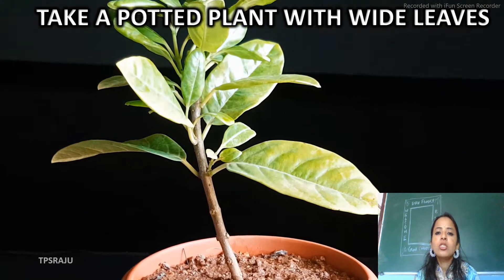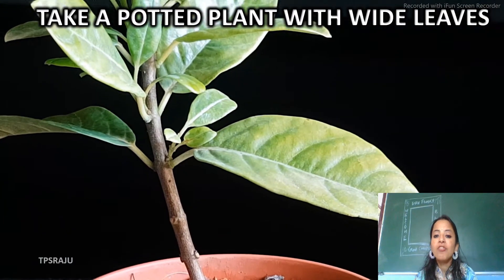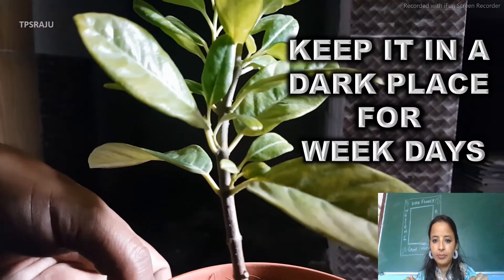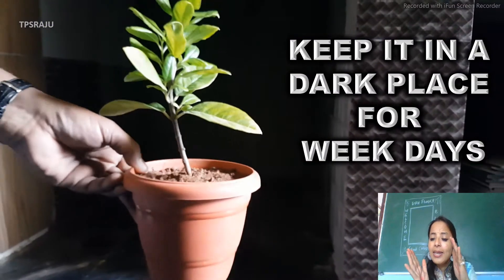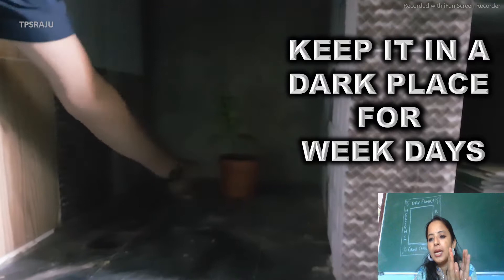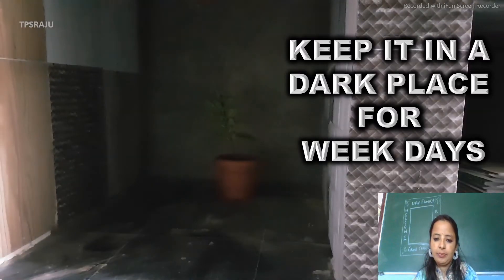First of all, you are supposed to take a potted plant with wide leaves, as you can see on your screen. Then kindly keep that pot in a dark place for a week. We are keeping it in the dark so that all the starch must be finished off which had formed when we kept it in sunlight.